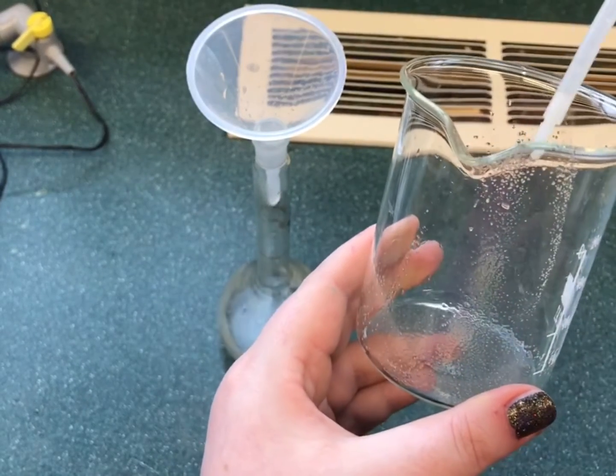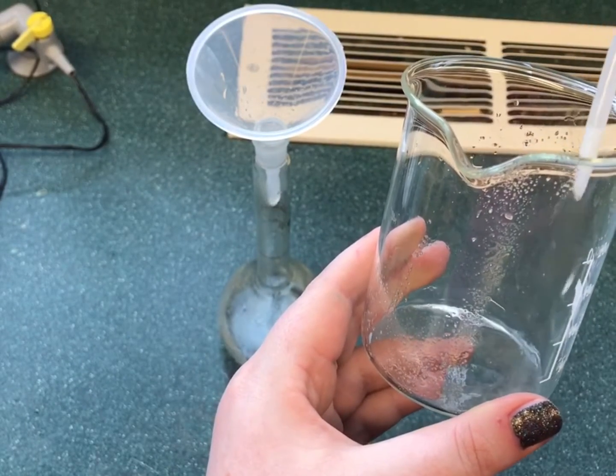This process is repeated with small volumes of deionised water until the glassware is clean.